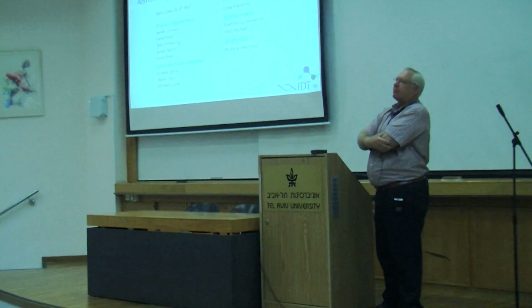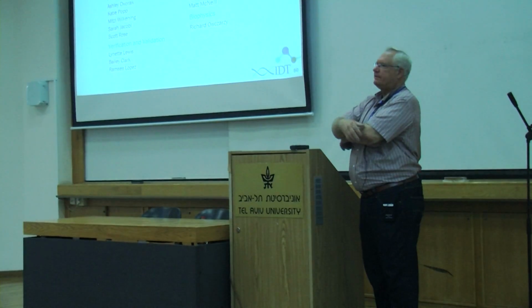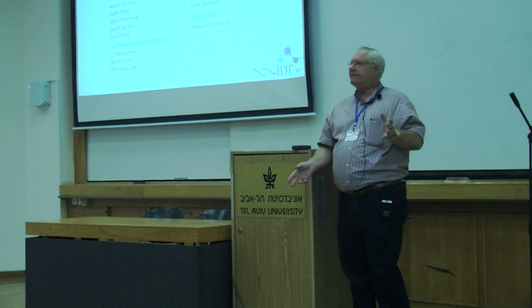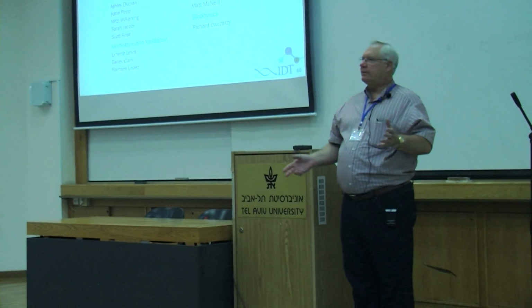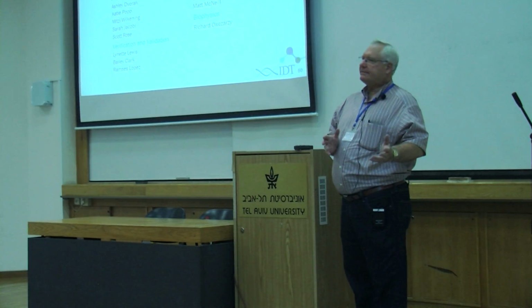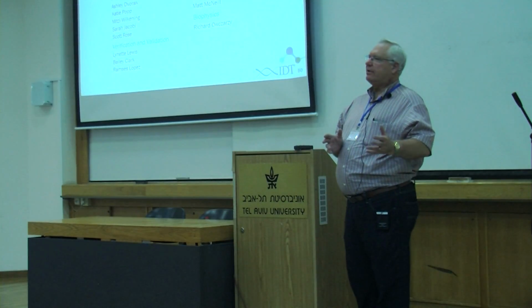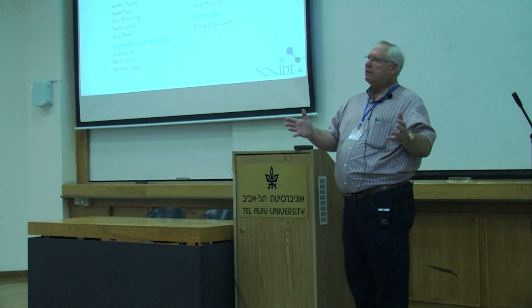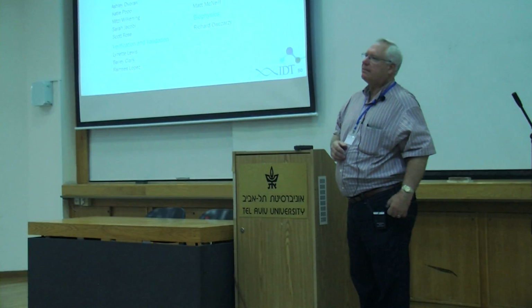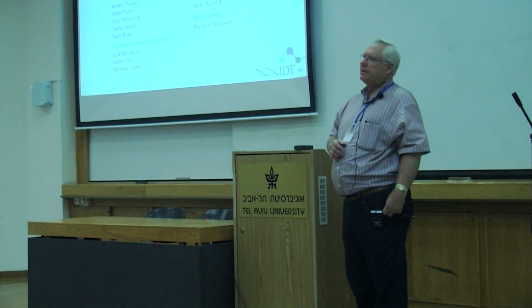We do amplicon-based, just because there are two ways to hunt CRISPR off-target effects. One's going to be a biased, the other's an unbiased approach. For a biased approach, you're predicting the sites, you know where those sites are, and frankly, it's easier to make a small multiplex pool if you're just looking at 50 sites or something. So we actually do that with amplicon-based.